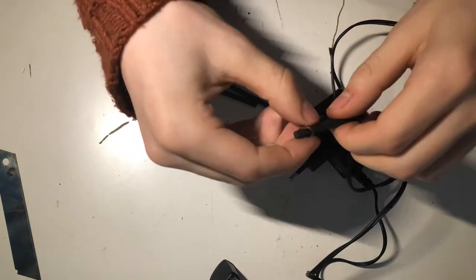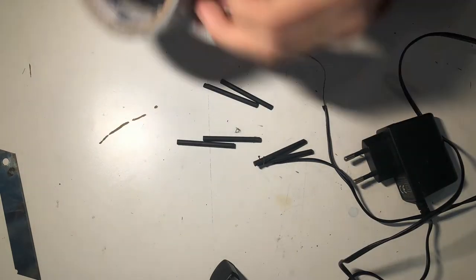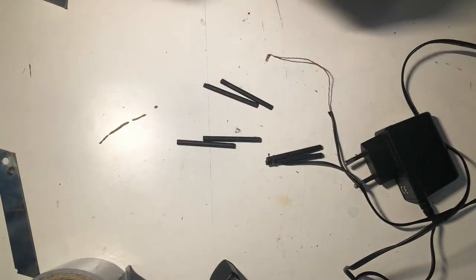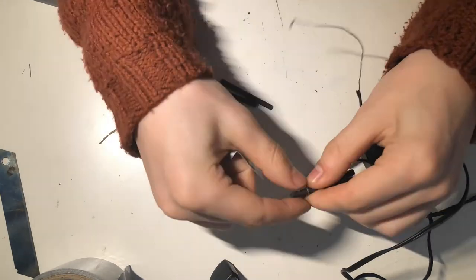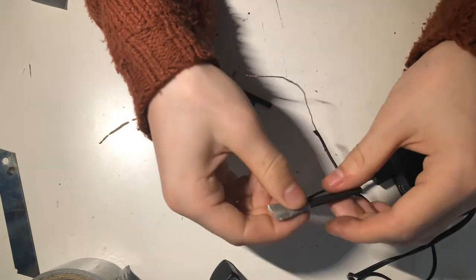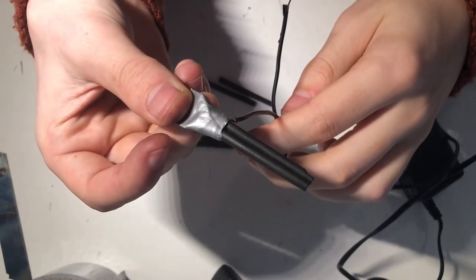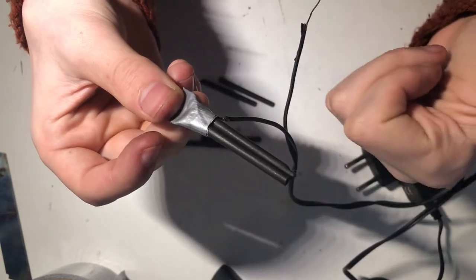Make sure you know which one is the anode and which one is the cathode, because the graphite electrode needs to go onto the anode — if you don't do that it will mess up. So make sure you get that right. When you're done, it should look a little bit like this.